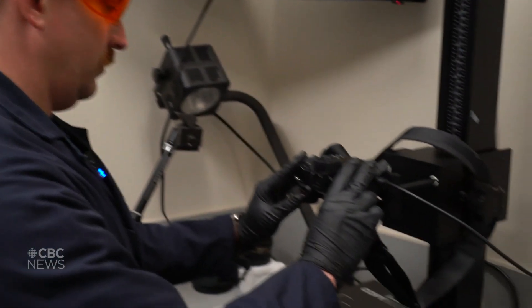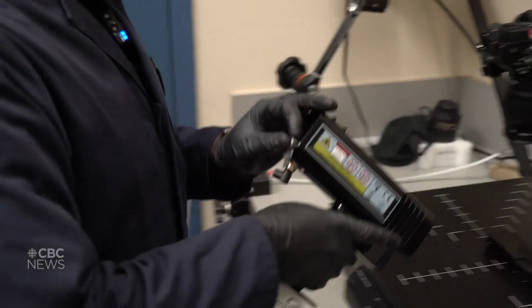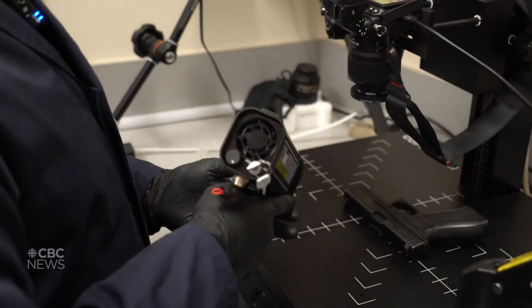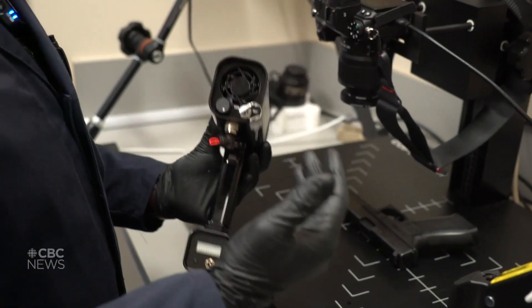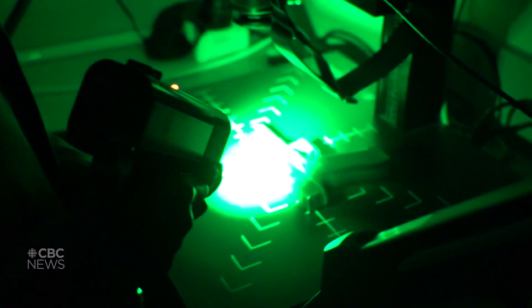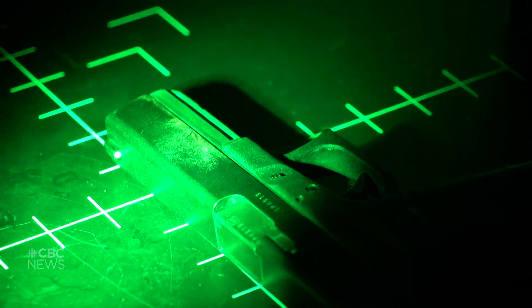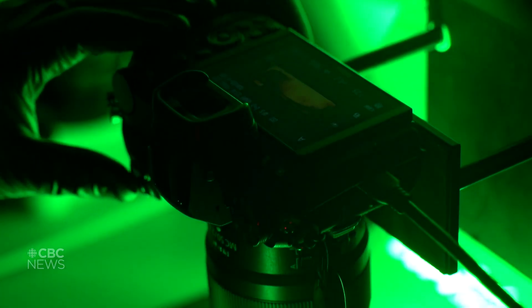What I have set up here is a camera attached to a television. What I'm doing here is shining a laser at the fluorescent powder. The powder should excite to the point where it will become visible if there's a fingerprint on this firearm. And now this fingerprint is preserved.